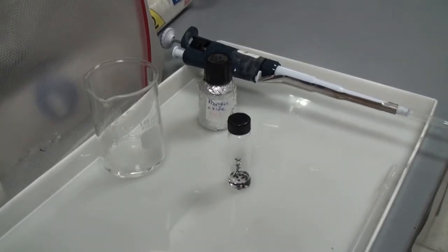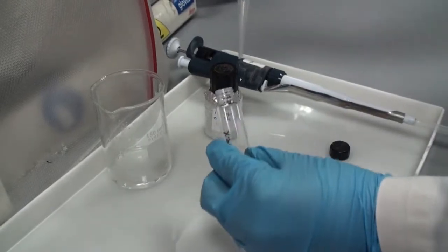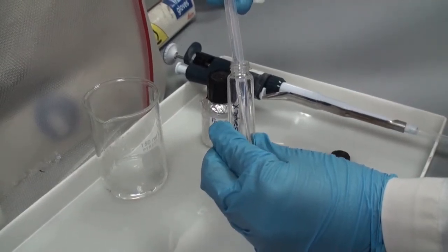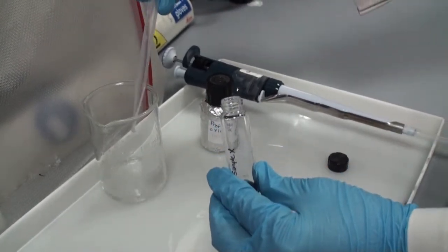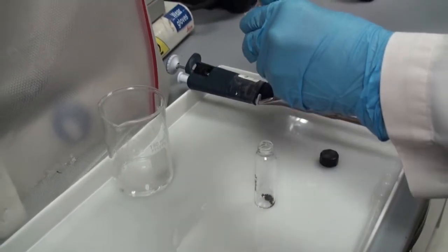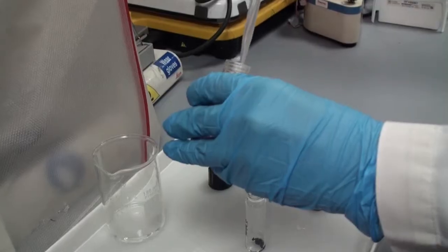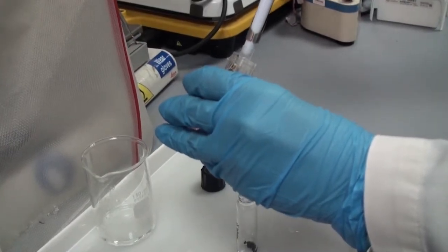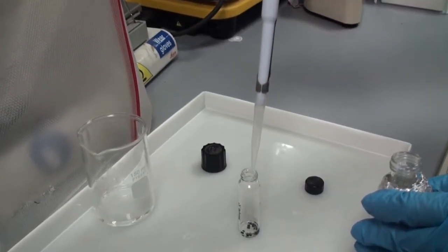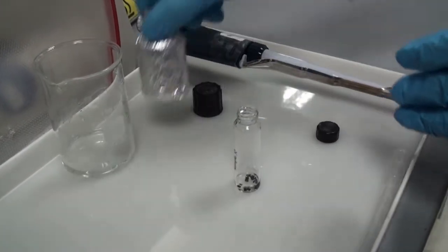We will now remove the 100% ethanol and replace it with propylene oxide. Note that propylene oxide is light sensitive, so we keep the material shielded from light. This step will be repeated twice, each time leaving the material for 15 minutes.